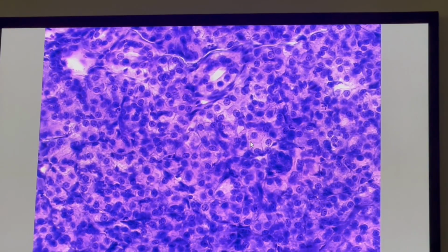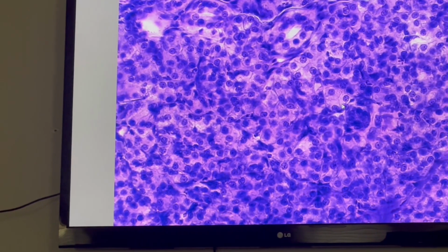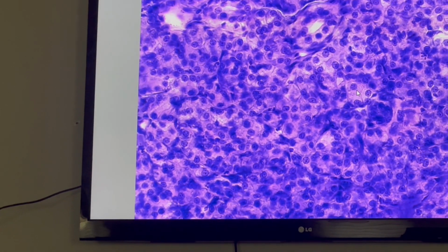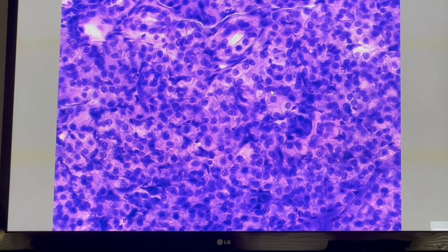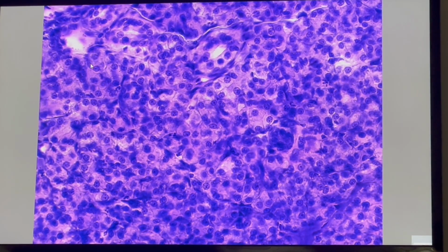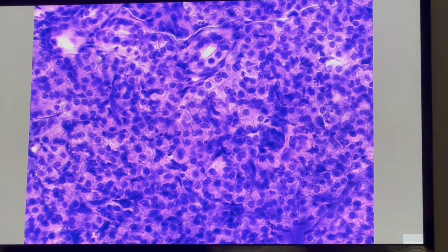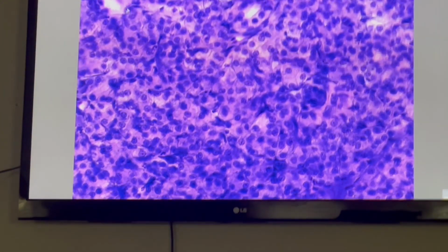Serous cells are pyramidal in shape with rounded nuclei. Serous acinus consists of serous cells arranged in a spherical structure called serous acinus.